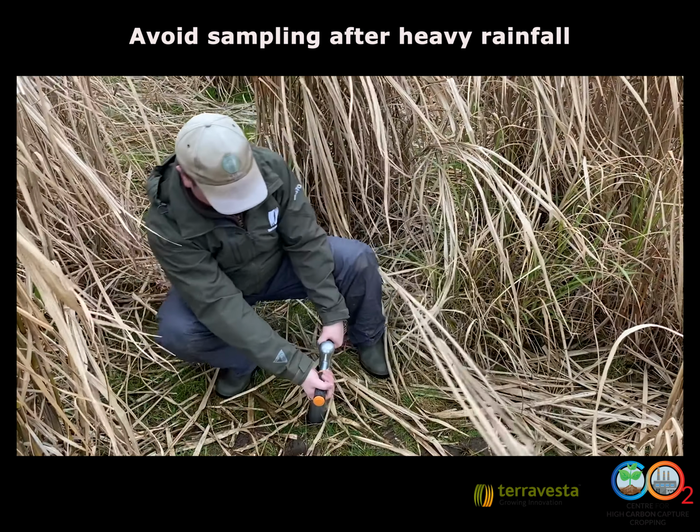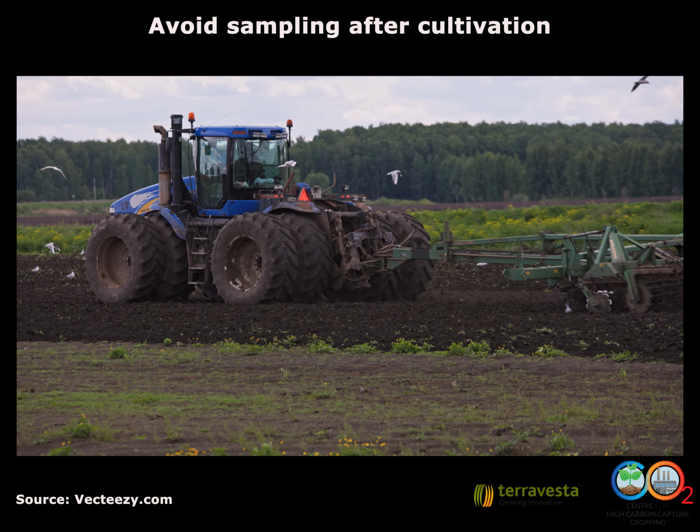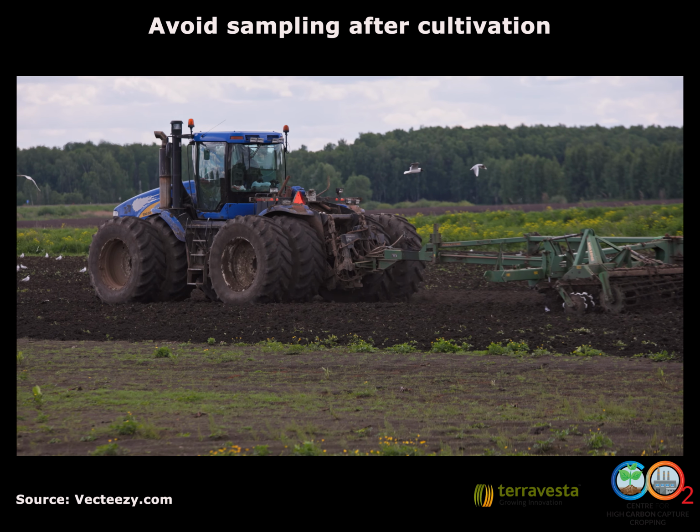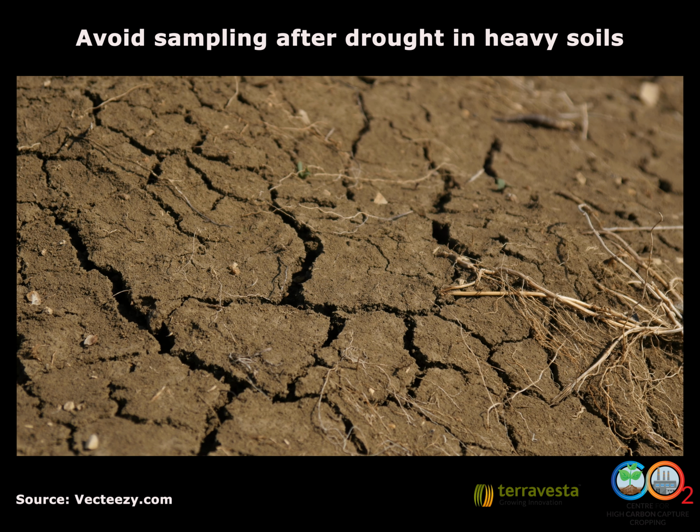One should also avoid sampling after heavy rainfall, as it's hard to remove soil cores out of the mud, after cultivation, as loose soil will influence the bulk density analysis, and after periods of drought, especially in heavy clay soils.